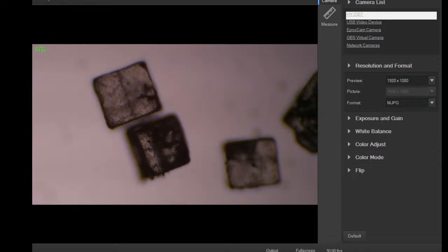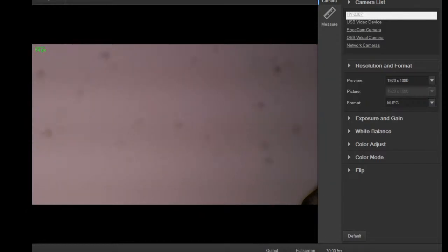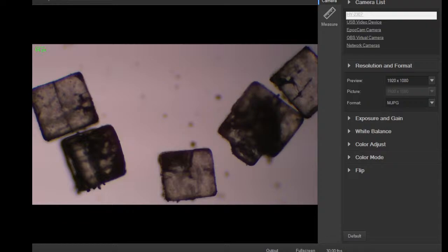And they can make them in the lab. Supposedly, if you're doing welding and cutting with a torch, some of the carbon steel breaks off and forms little buckyballs in the area, but you have to use a microscope to see them. But yeah, that's sodium chloride. This is not the kosher sea salt, which comes kind of crusty and chunky. This is just the iodized table salt you get in every store and restaurant in the world. But it's pretty fun. So that's salt.